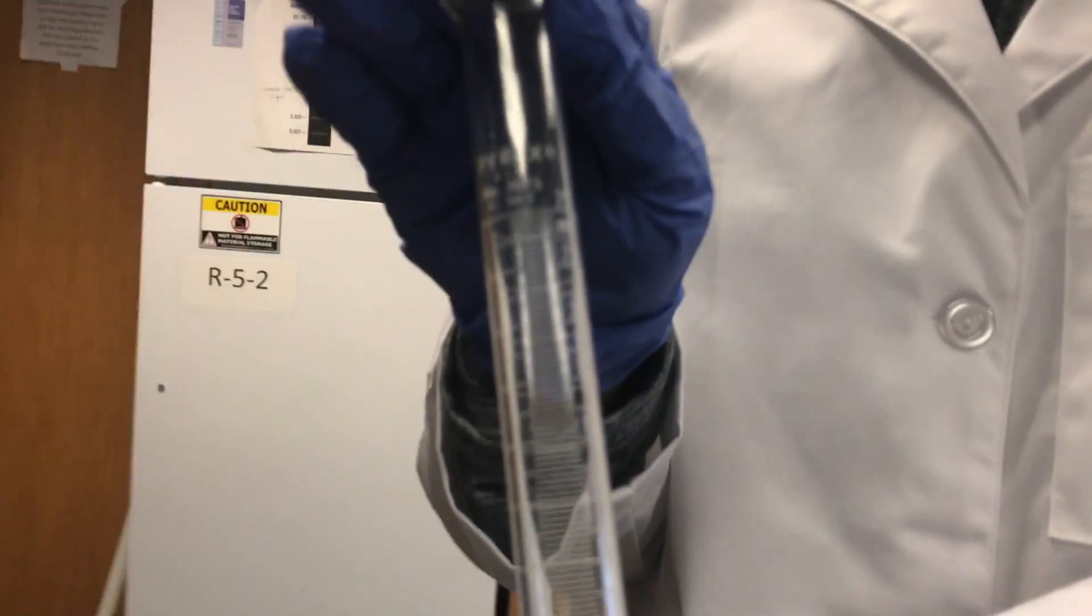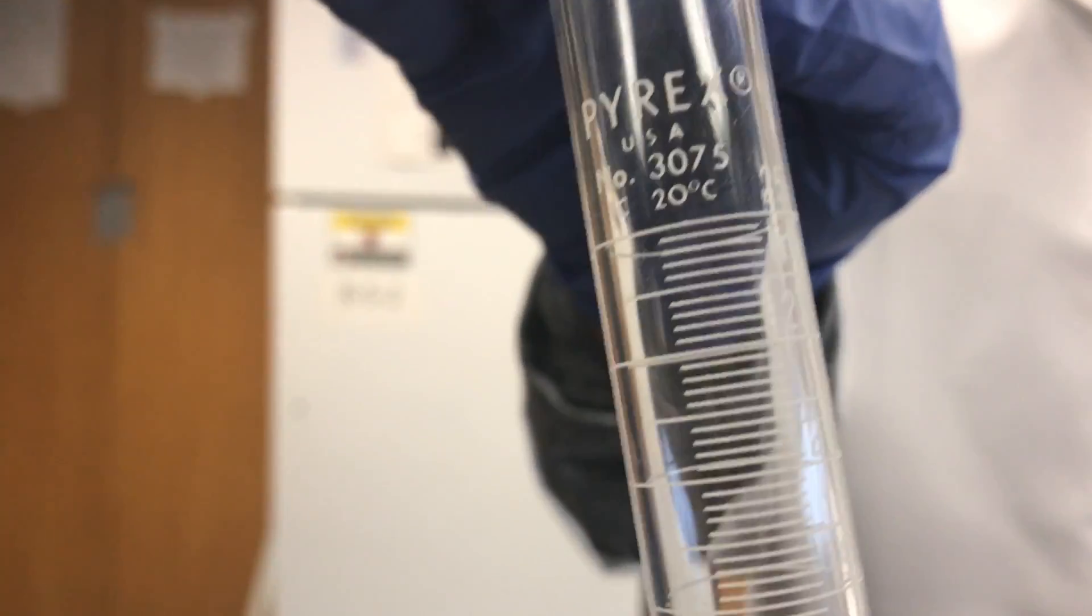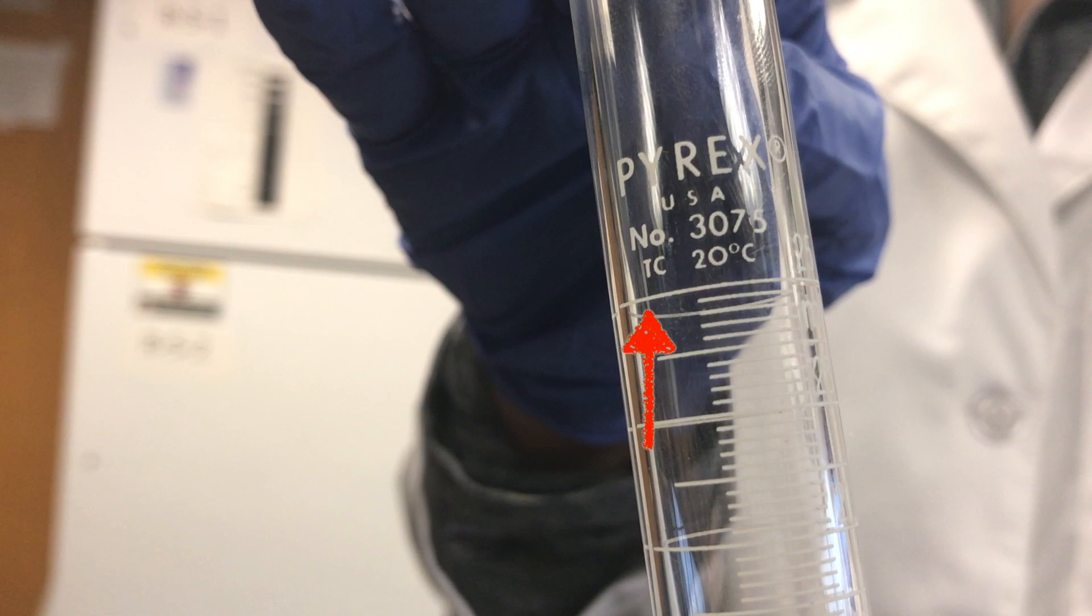On this piece of glassware you can note that it says TC and not TD. This means to contain and in order to accurately use the glassware you must rinse it with DI water to ensure the transfer of all of the liquid.